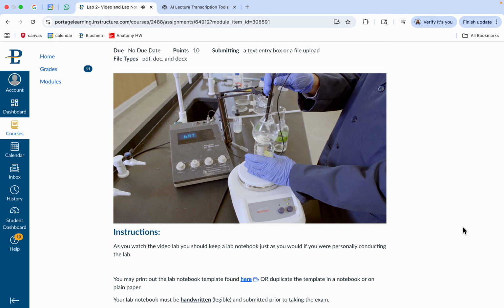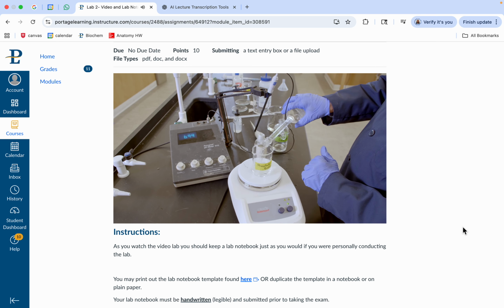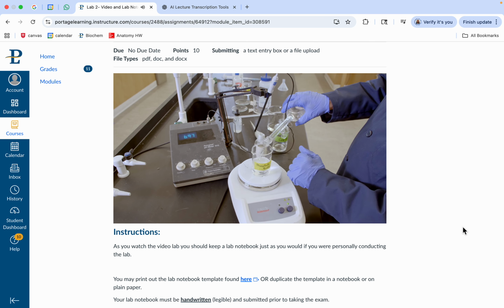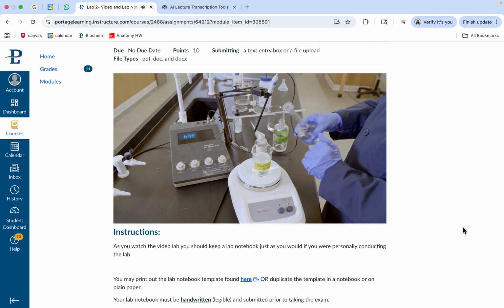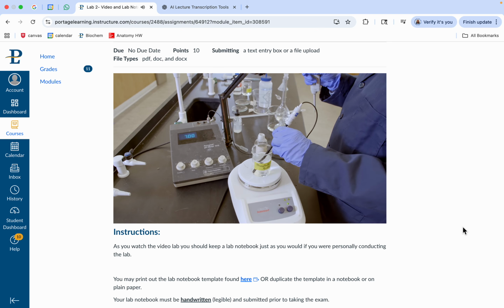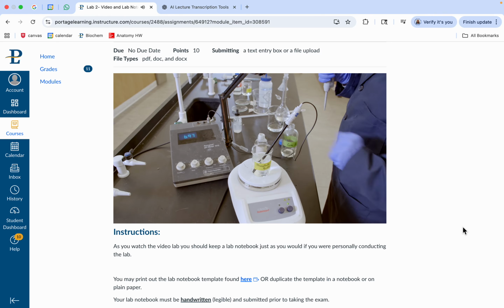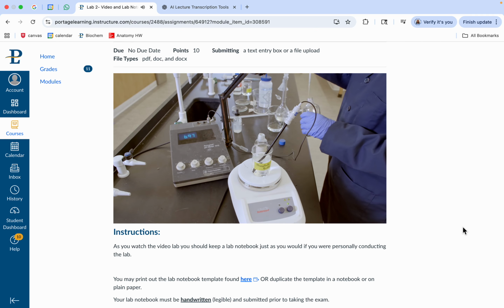One of the things we can do is test the pH to see if it's really doing its job. We'll compare that to water. Let's go ahead and put in about 100 milliliters, I think we'll go with about 120 or so, of this phosphate buffer, and then we're going to add some strong HCl to this. We'll just put it to the side. You can see there again, we're still maintaining about 6.96 or so pH, and we'll add some HCl to that.